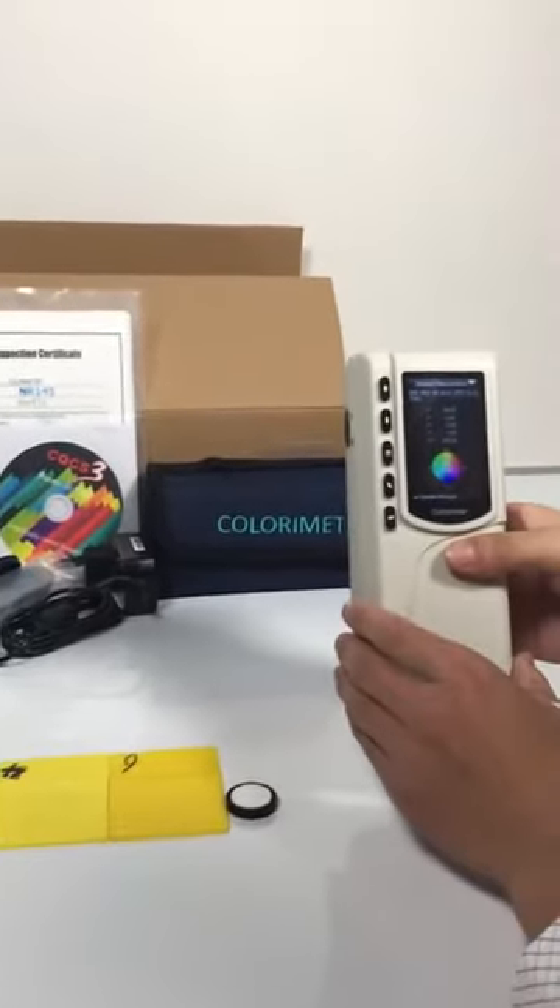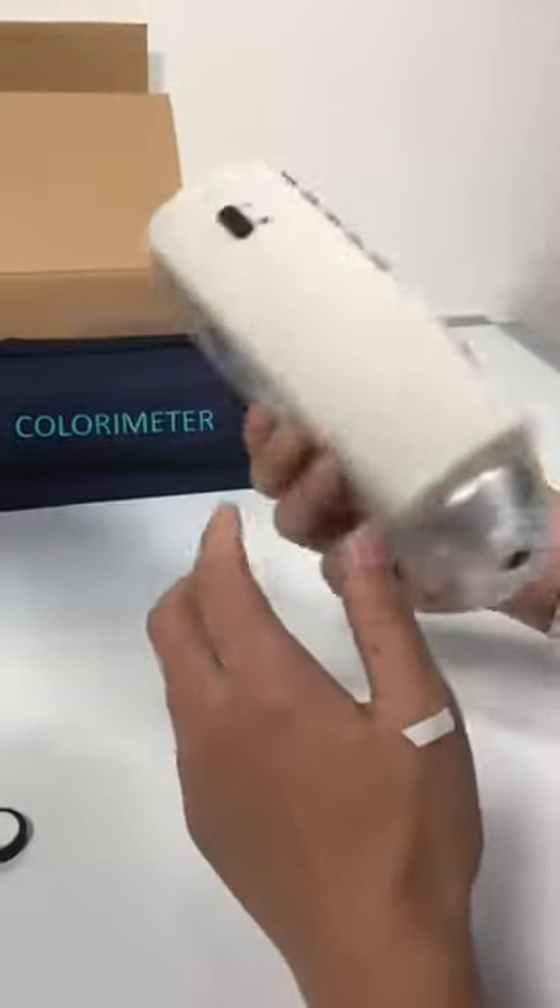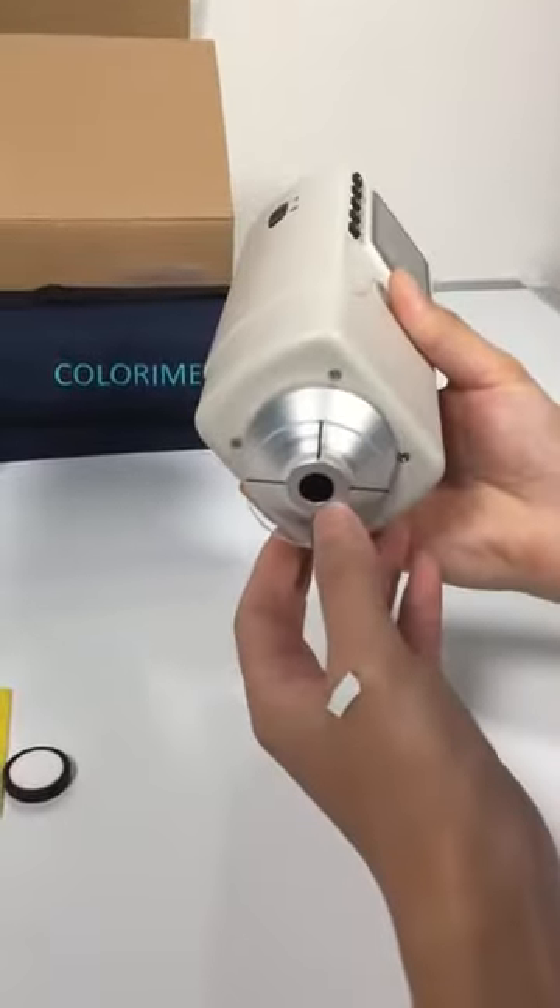This is the colorimeter NR145, the power switch, the mirror button, and the mirror aperture.